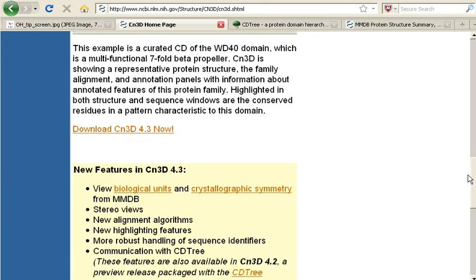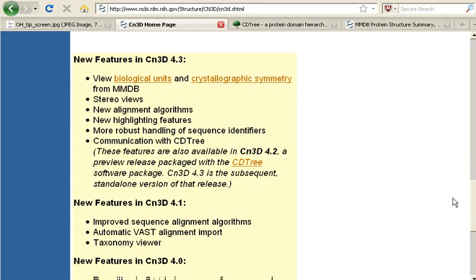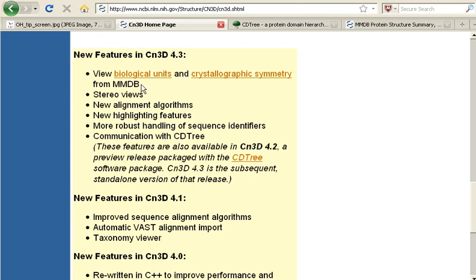you will see what new features are in each release. So here you can read that in the 4.3 version, you are now able to view biological units and crystallographic symmetry from MMDB, you can view stereo views, all sorts of things, and the software is now also able to communicate with CDTree.